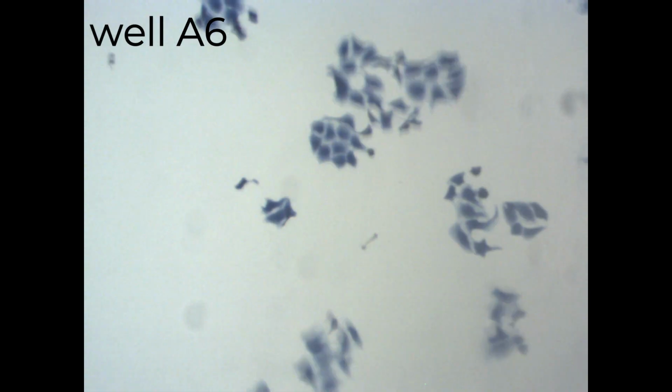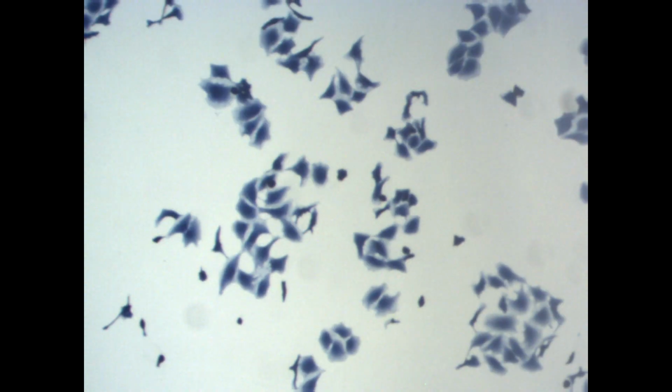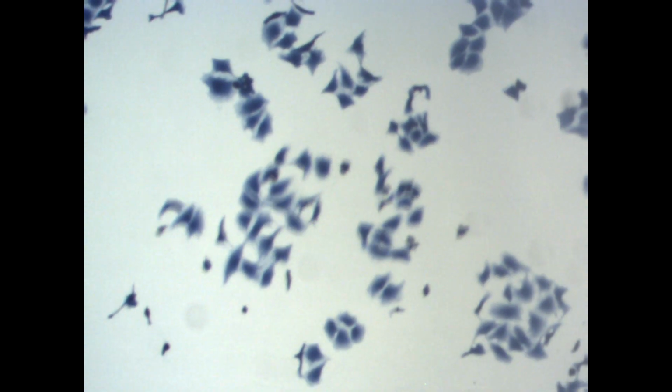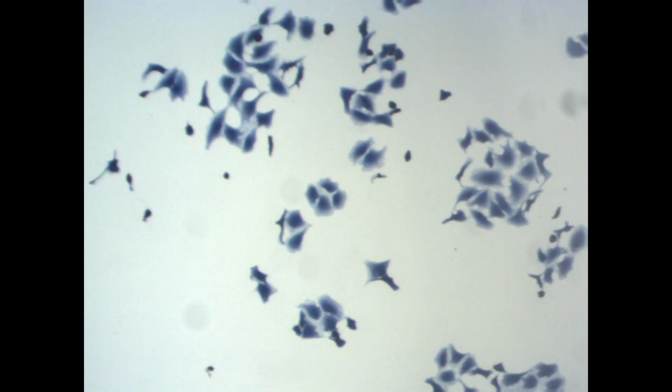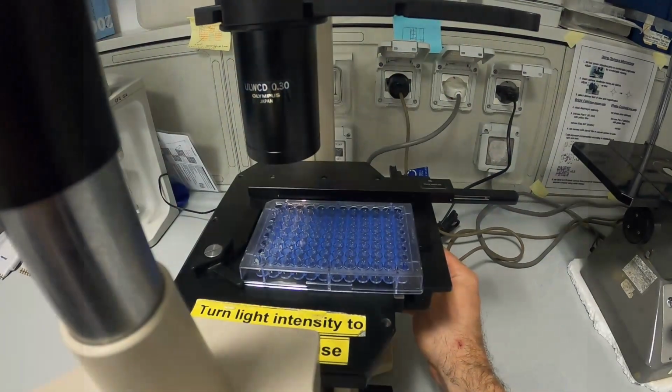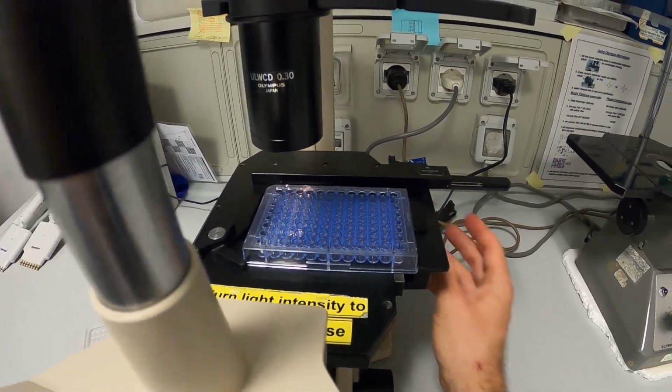A6, again positive, scattered cells. Some are very funny, they're much bigger, little pancakes, but the overall idea is really that they're well scattered. Keep changing the location with the XY platform, and keep observing them under high magnification.